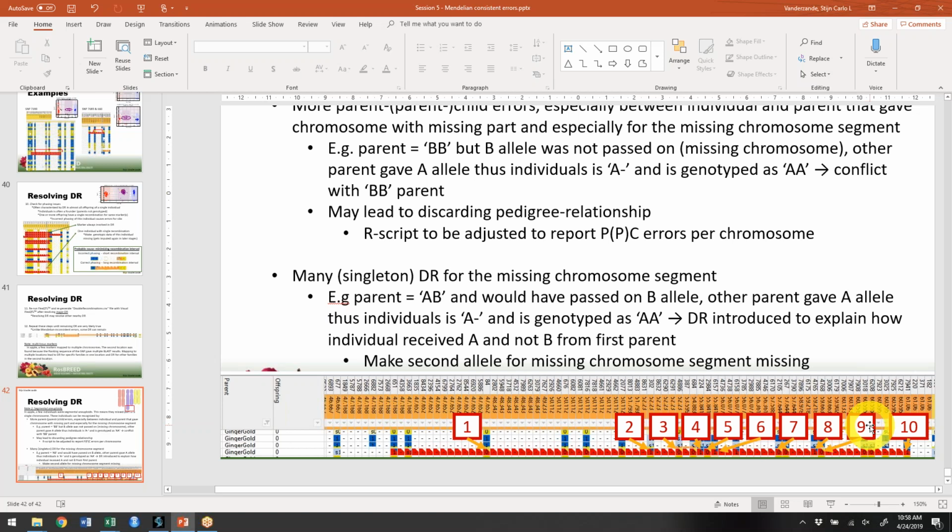So just as a quick summary: look at double recombinations, look at the singletons first, look at ones where there are a lot, and for those, check your genotyping calls. Once you've done that, go to the second file that is created, where it reports over a specific distance where multiple markers can be involved. Check those for regions where a lot of double recombinations happened, and then slowly make your way down to double recombinations that just occur a few times.